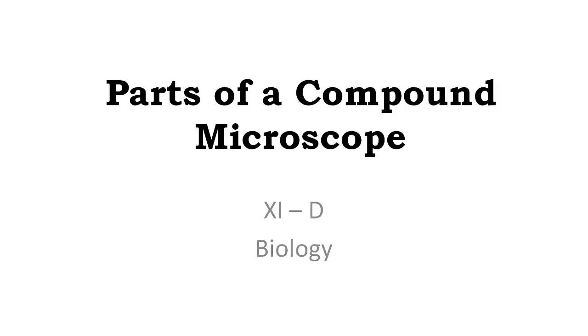Hello everyone, welcome to class 11 biology. In this video, as a part of your biology practicals, we are going to study the parts of a compound microscope. We all know what a microscope is. It is an equipment with which we can see very small objects.